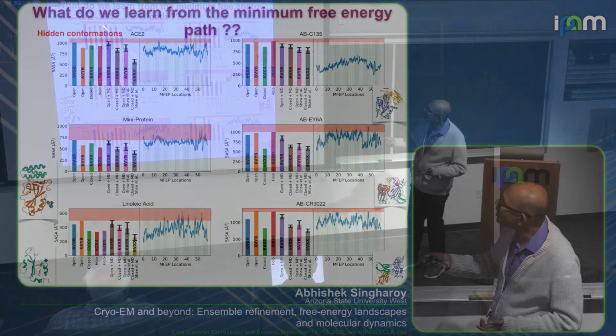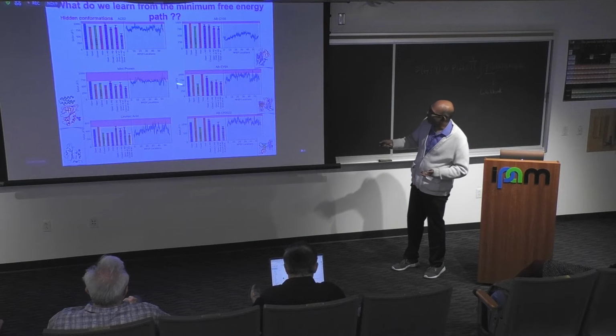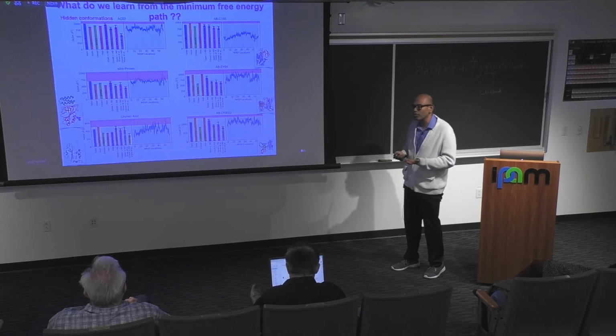We found certain very rare conformations with solvent accessible surface area that are either higher or lower than whatever was experimentally monitored before.